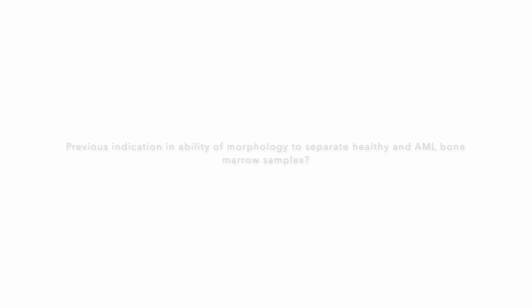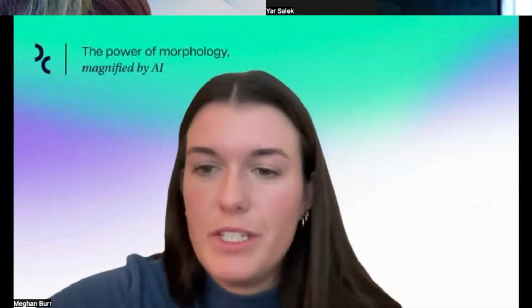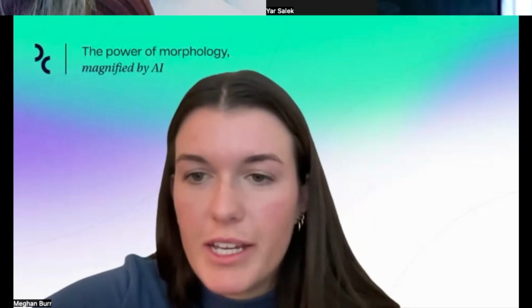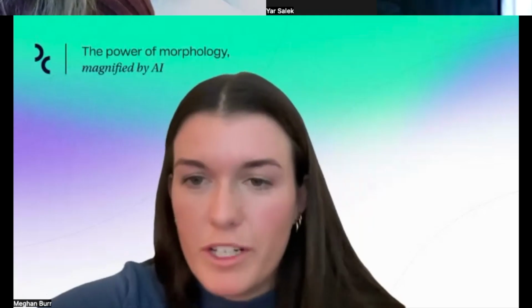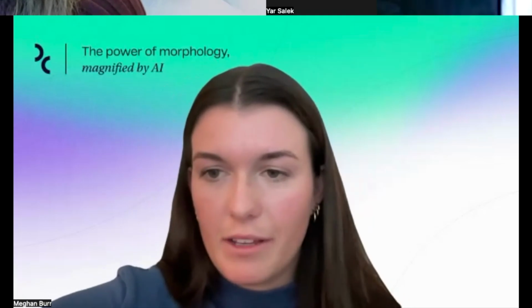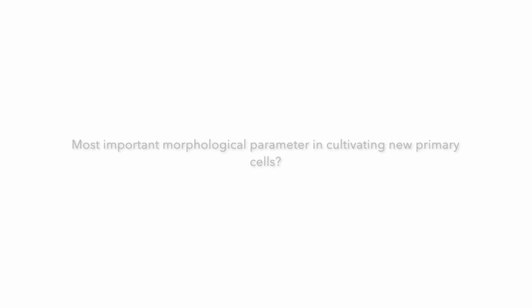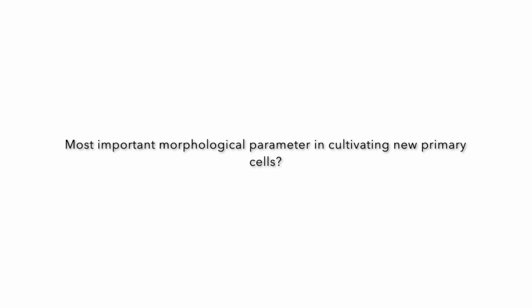Awesome. Thank you. I see another question. Someone asked, what is the most informative cell parameter regarding its morphology when you are trying to cultivate new primary cells? I think this can go to either presentation. Maybe for more primary cells, Caroline, do you have an inkling as to which morphometric feature was more useful to you, whether you used the differential features tool to look at the morphometric features over the deep learning features?